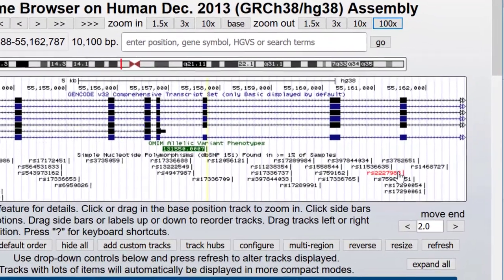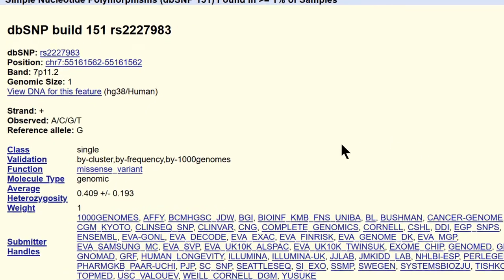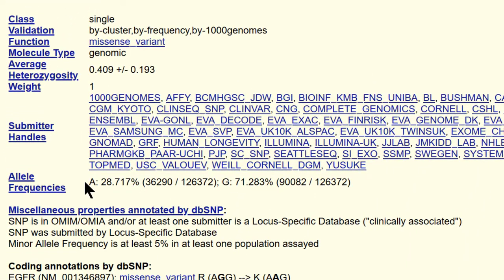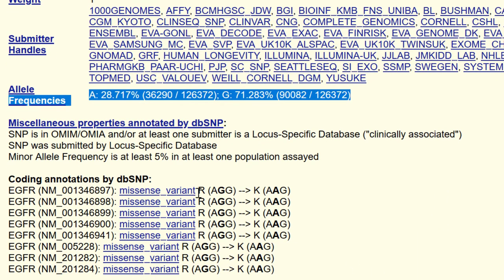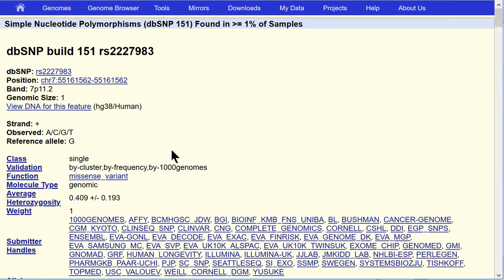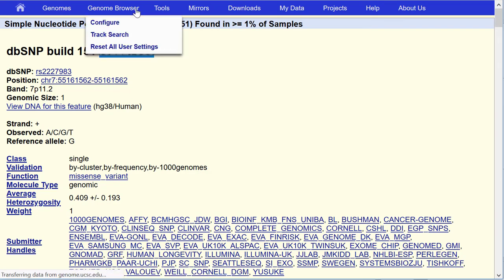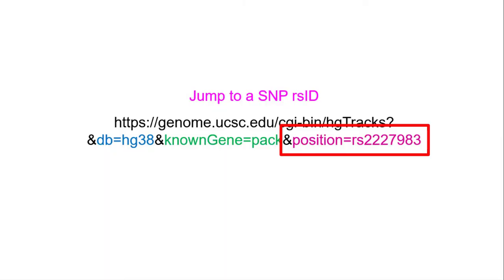There is one SNP over here that is red, meaning that there is an amino acid change. So let's click into that one to copy the RSID. You can see the change: we have a G to A transition, with A having a minor allele frequency of 29%. The variant leads to an arginine to lysine change. There is at least a conservative change of one positively charged amino acid to another, perhaps explaining why it can be so common in the population. Let's copy the RSID: RS2227983. The low RSID is consistent with the allele frequency — common SNPs are more likely to have been found in the early days of sequencing and have lower numbers. Now we can add the SNP to a URL as the value for the position variable and go there.